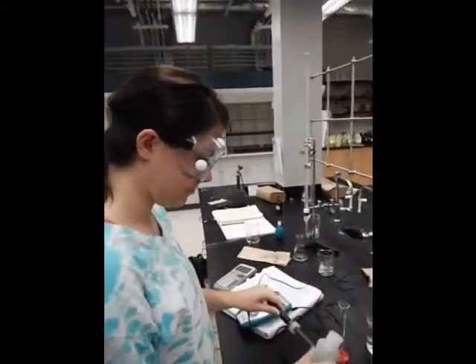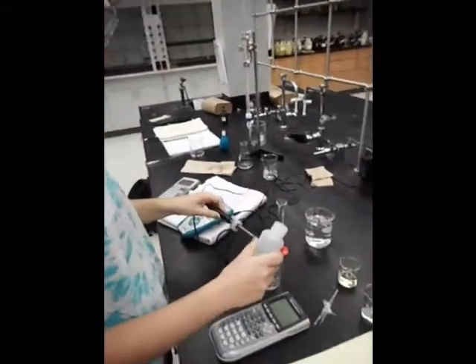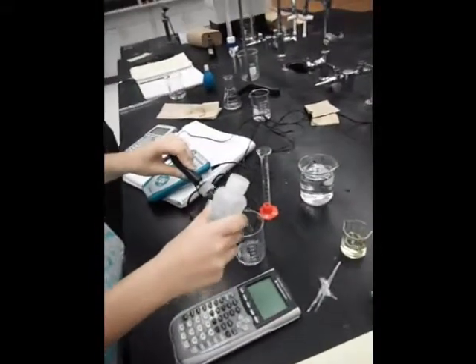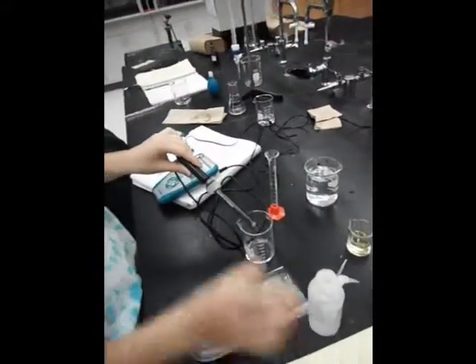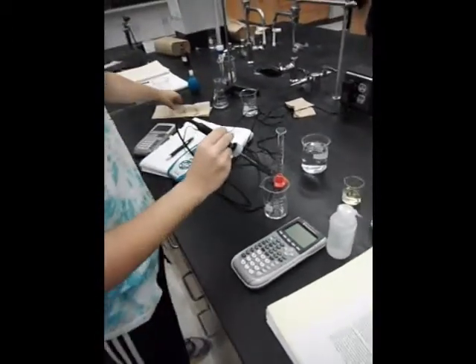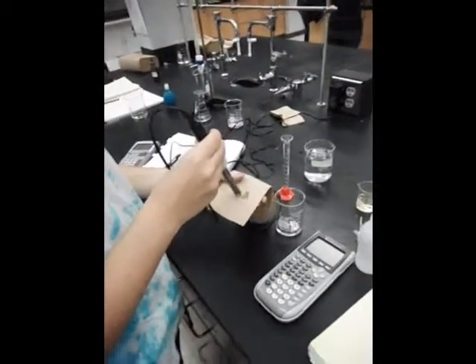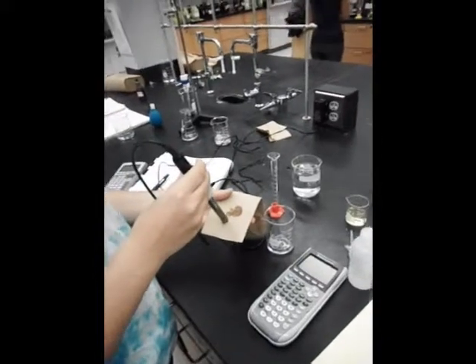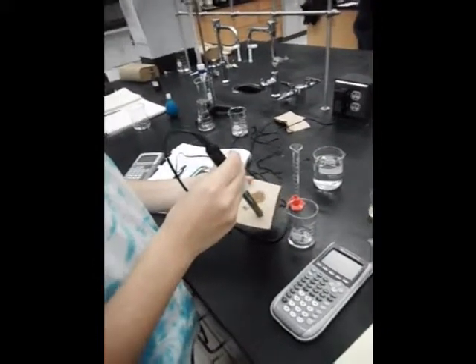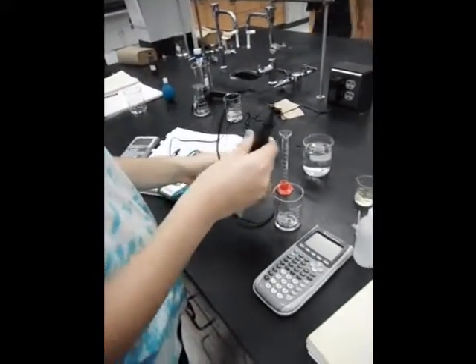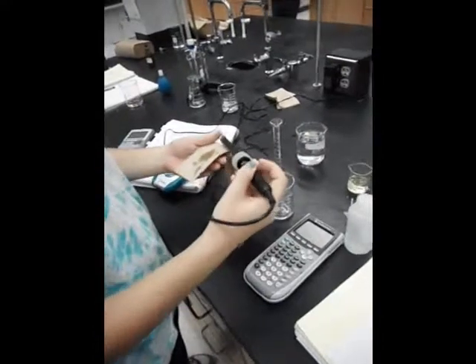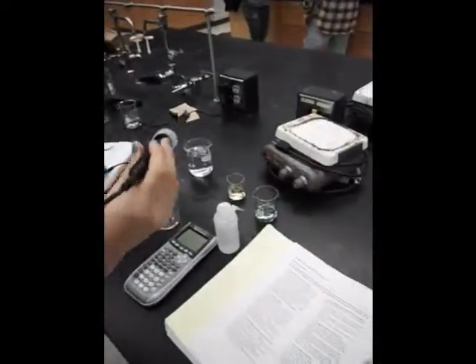Once the pH is calibrated to read the 4 through 7, you're going to want to clean it off again with the deionized water and dab it with a paper towel. Then you're going to re-read the pH buffer 7 to make sure that it's able to read the pH properly.